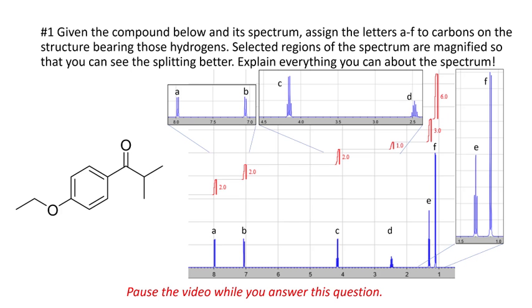Okay, we're back. How did you do? First, I'm going to draw the hydrogens on these various carbons, and I'm going to figure out what the formula is.